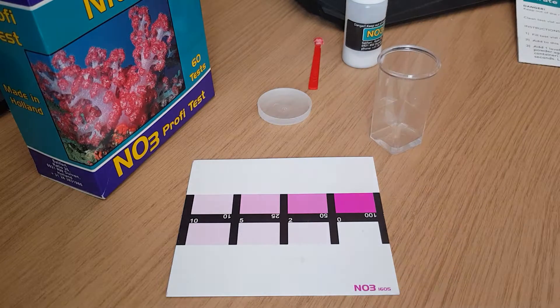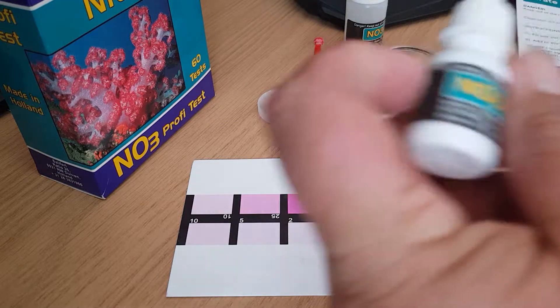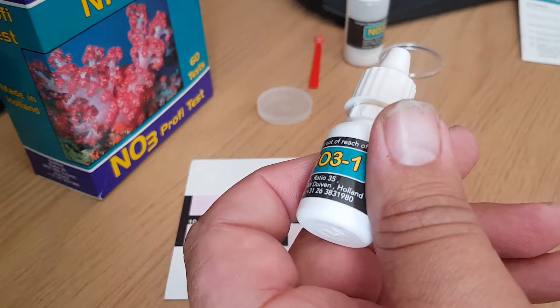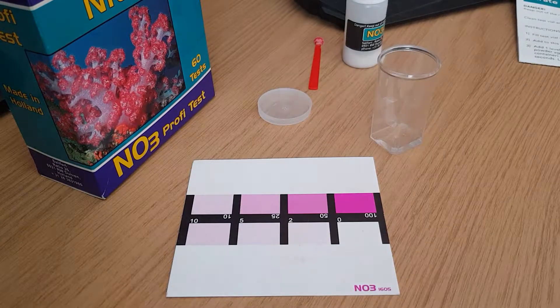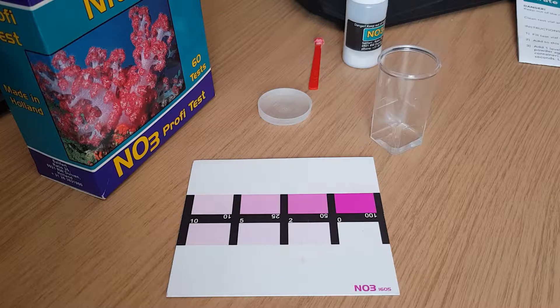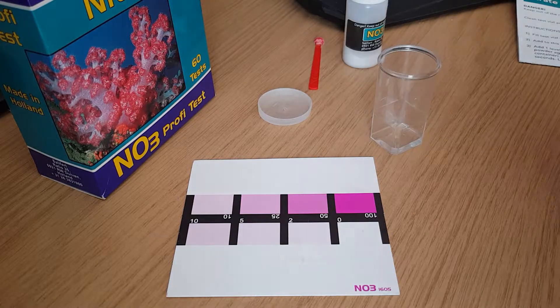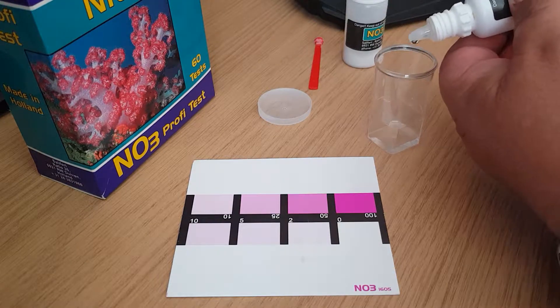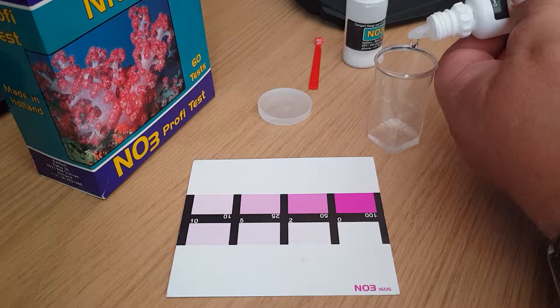It says to add four drops of the NO3-1, which is this little bottle here. Remember to give it a good shake — always follow instructions as it says, it gives you a good reading. So one drop, two drop, three drop, four drops.